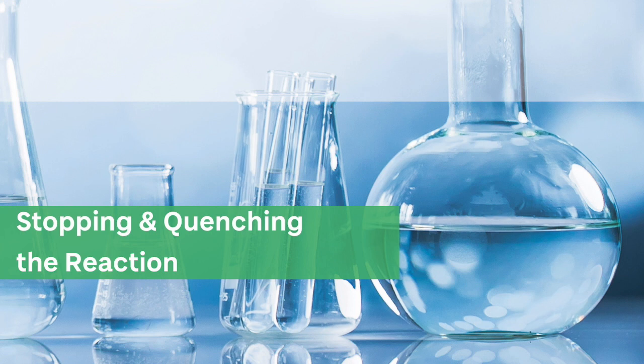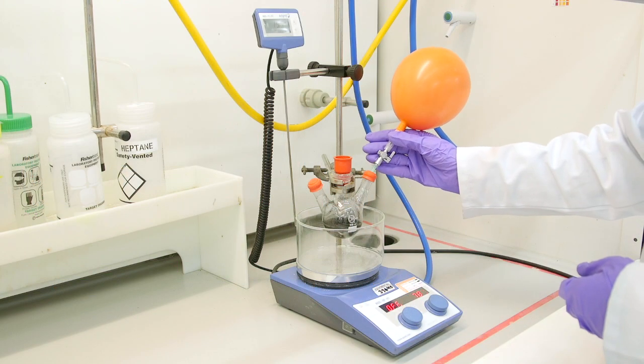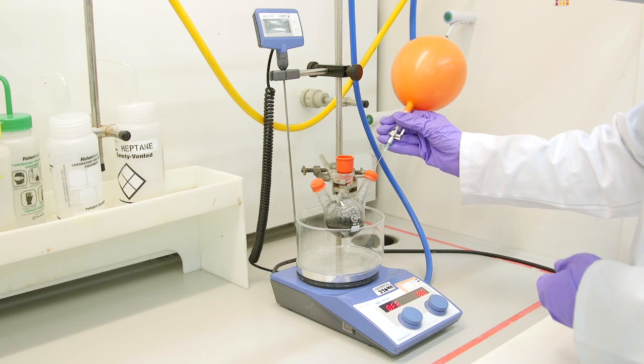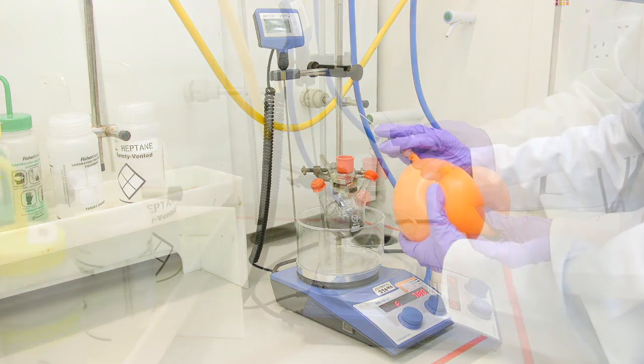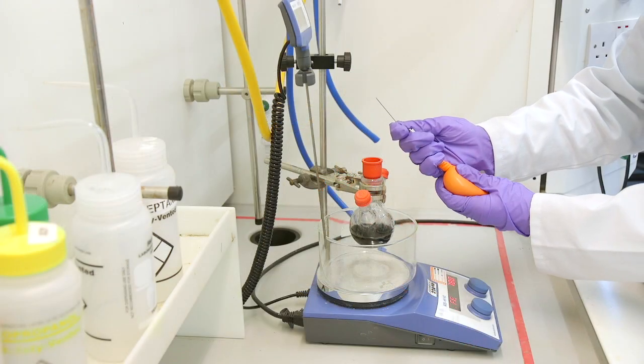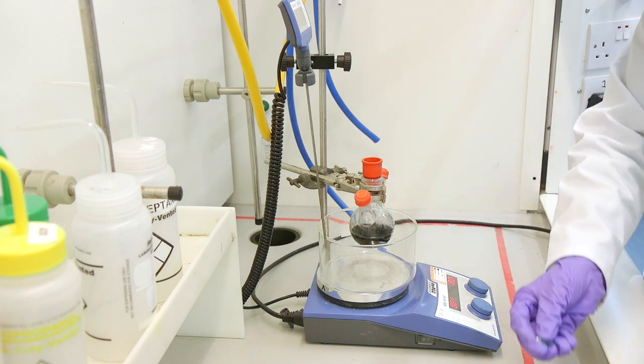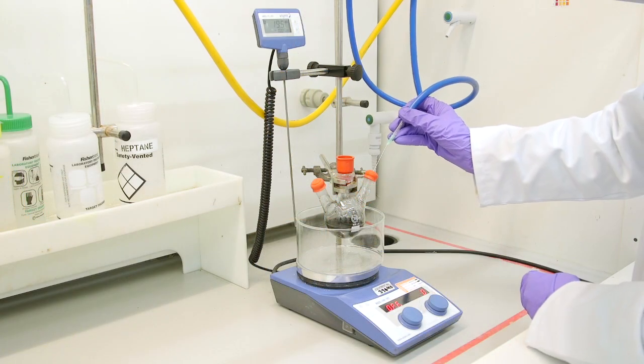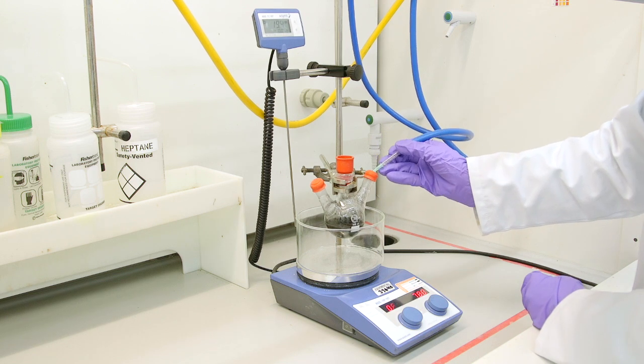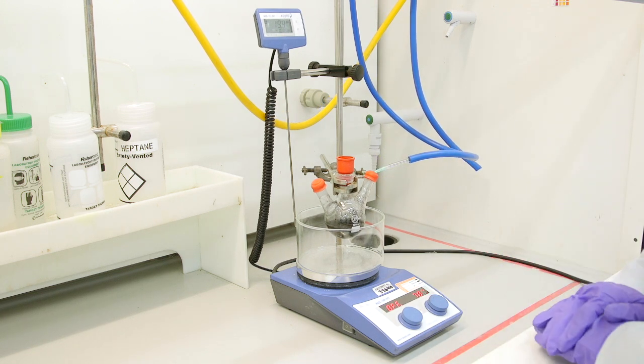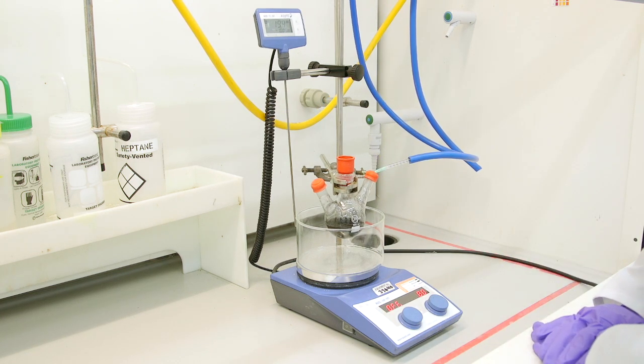Once you have confirmed your reaction has finished, you can remove the hydrogen balloon from the flask, hold the syringe upwards and gently squeeze the excess gas from the balloon. The reaction flask still contains a hydrogen atmosphere, so again we will have to vent it by using a vacuum line again.